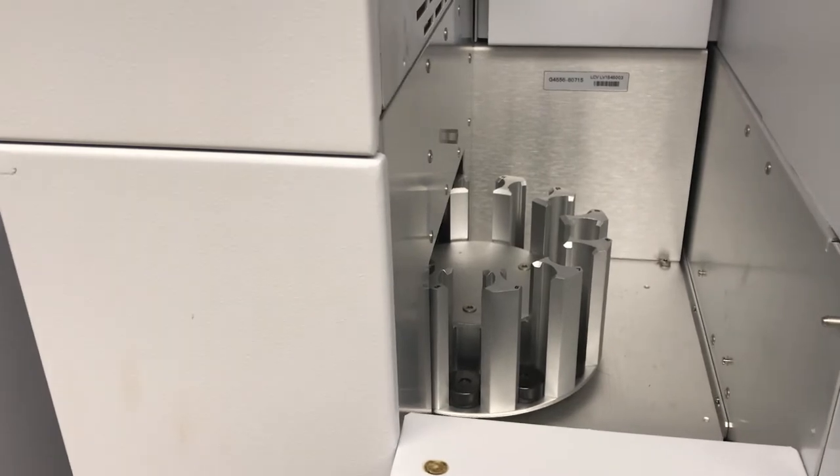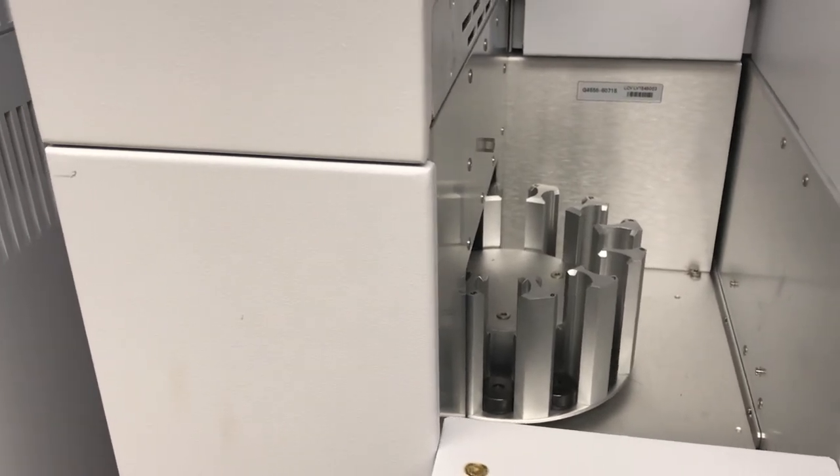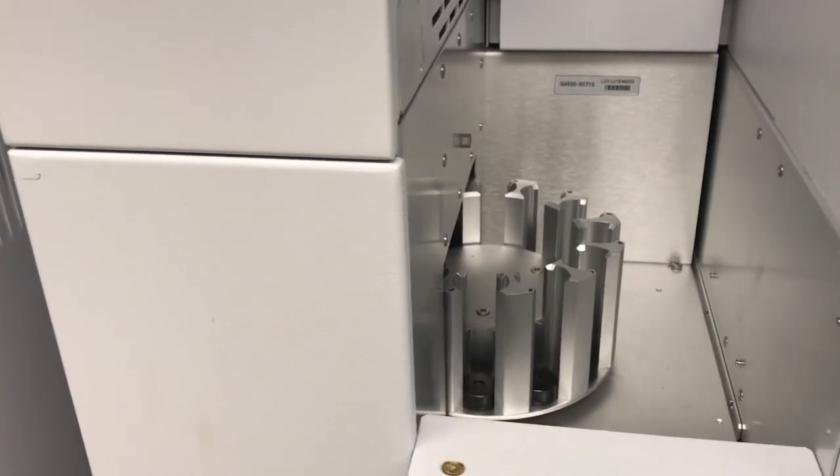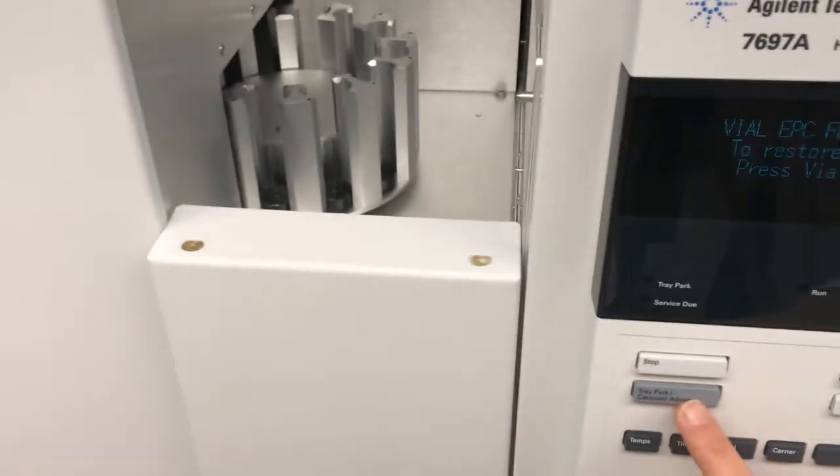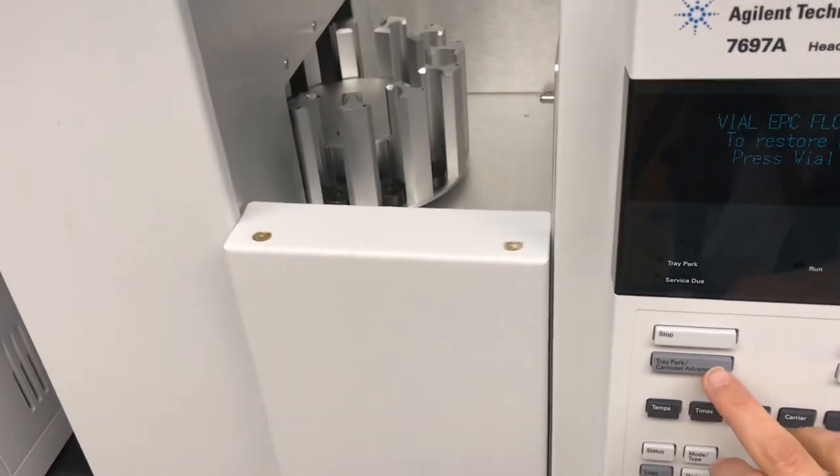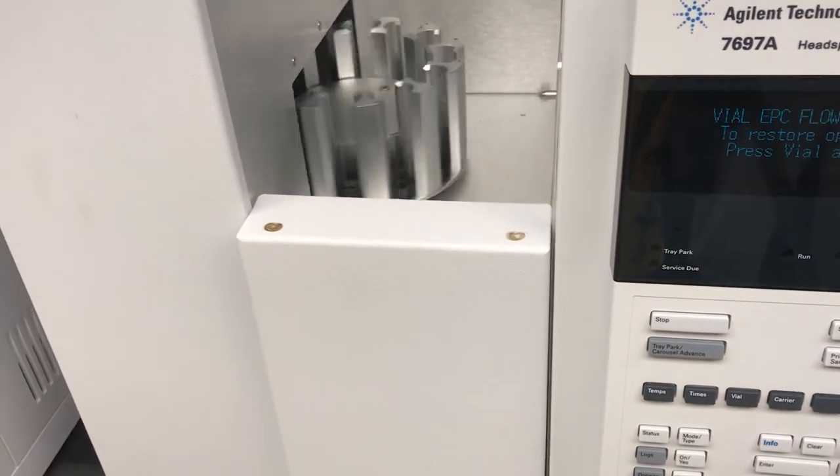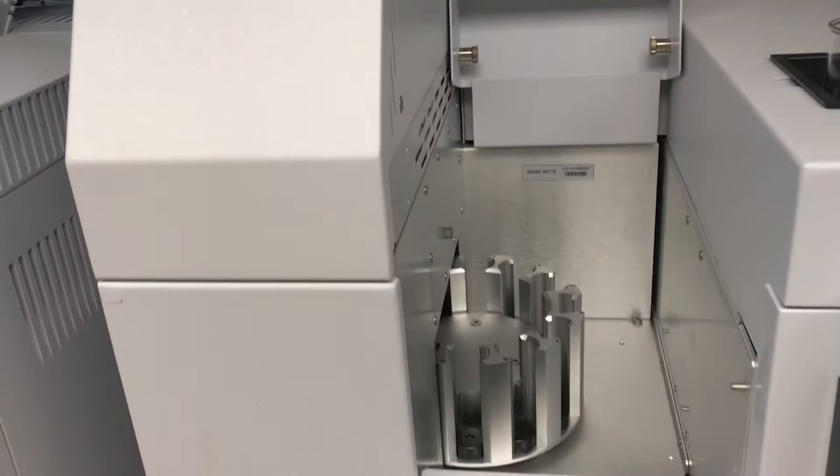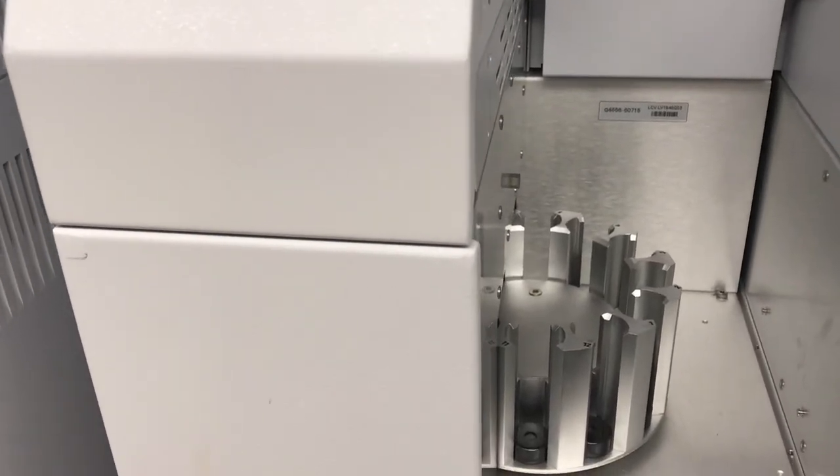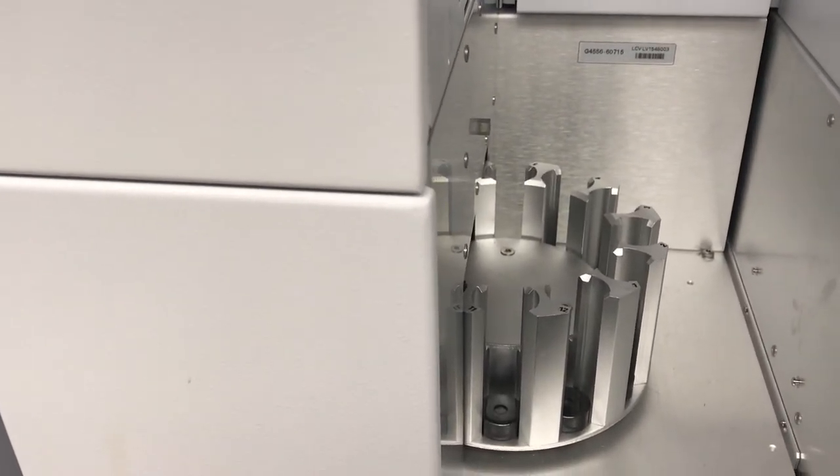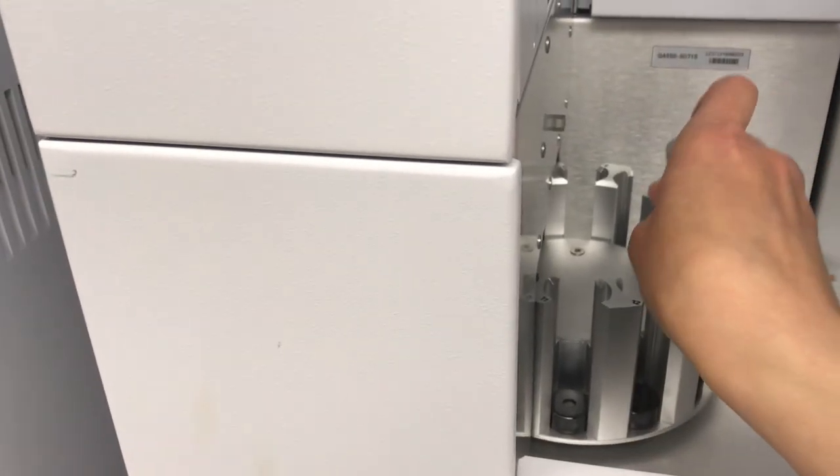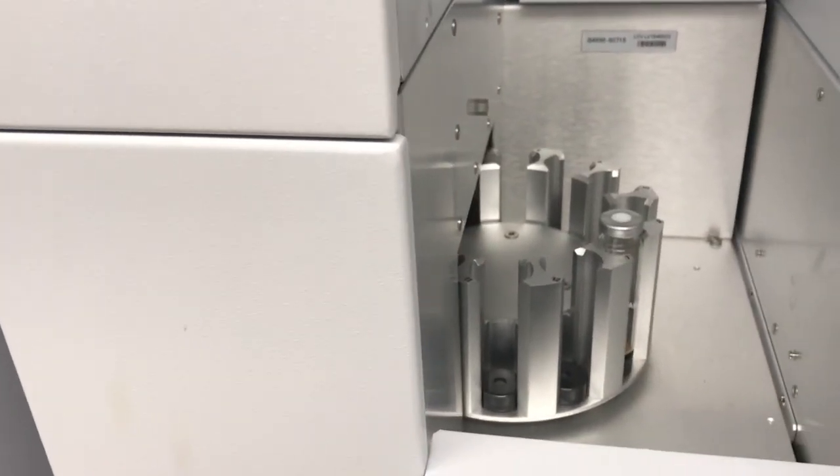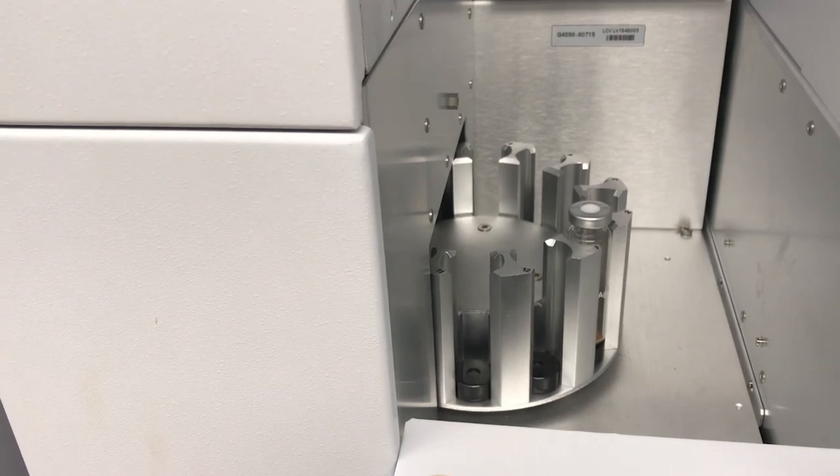I want to put the vial in sample one but I don't see it right now, so I'm going to push carousel advance on the front of the headspace sampler. That rotates the carousel so that now I can see where position one is. So I can just place my vial in there.